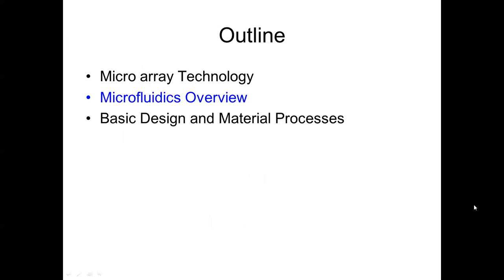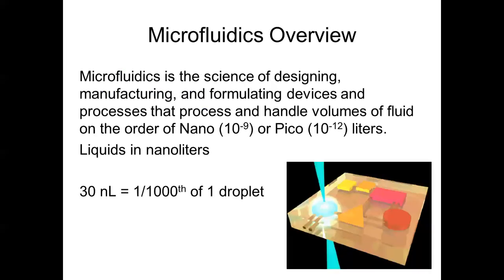So let's take a quick look at some microfluidic technology. So we need to build a DNA lab on a chip. It's necessary to consider fluidic flow in the micro and nano regime. That fluid flow is a lot different than the macro flow that we would see in our everyday life, like in the kitchen, bathroom, etc. So this tubing is very resistive, and for the most part in the microfluidic regime, materials don't mix, and fluid pressure is extremely high. So those are issues that we have to overcome.